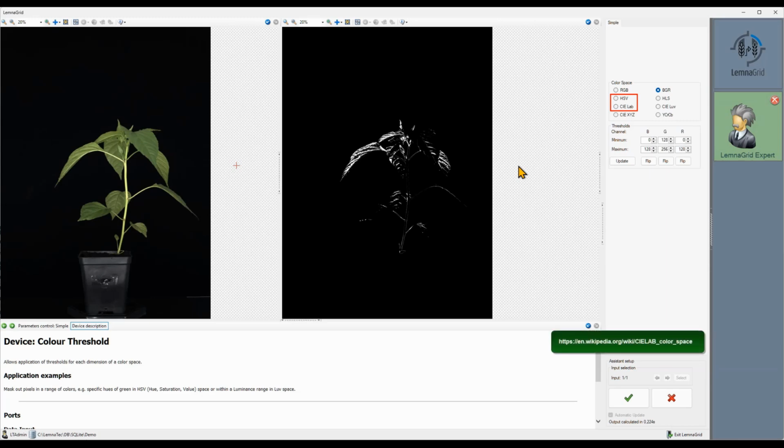By the way, what is a color space? Colors in digital images are represented by numbers, obviously. The camera records the images as values of red, green, and blue. This is the RGB color space. However, one may convert these numbers into representations of the same color which are easier to comprehend, or have some technical benefits in certain contexts. These alternative representations are called color spaces.